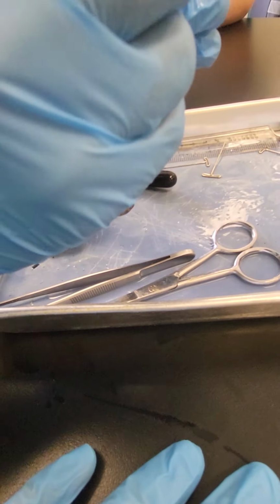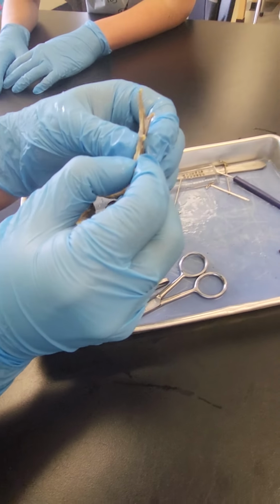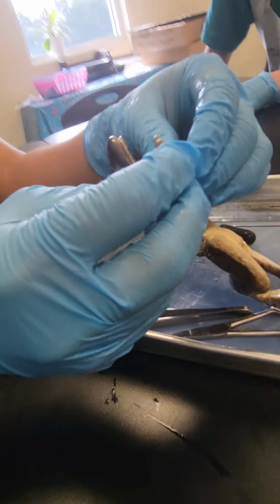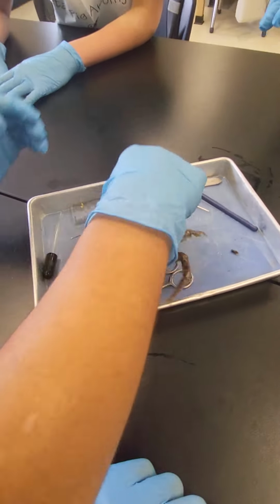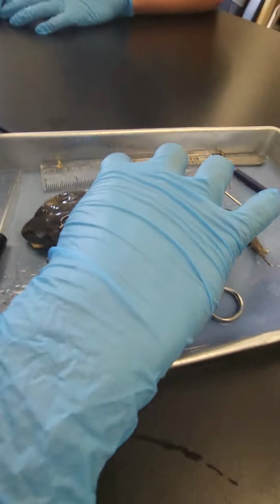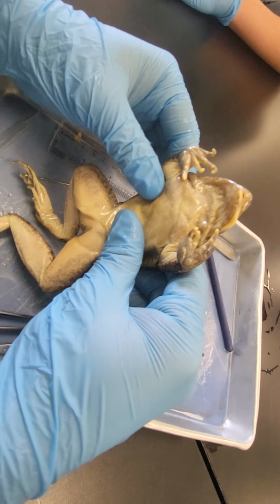Evan, how does it swim then? I thought the back ones are webbed and the front aren't. That is true. No, the back are. The hind legs are webbed, but the forelimbs are not. Yeah, that's what I'm saying. The fore are webbed? Let me get a look at his face. The fore legs are not webbed.